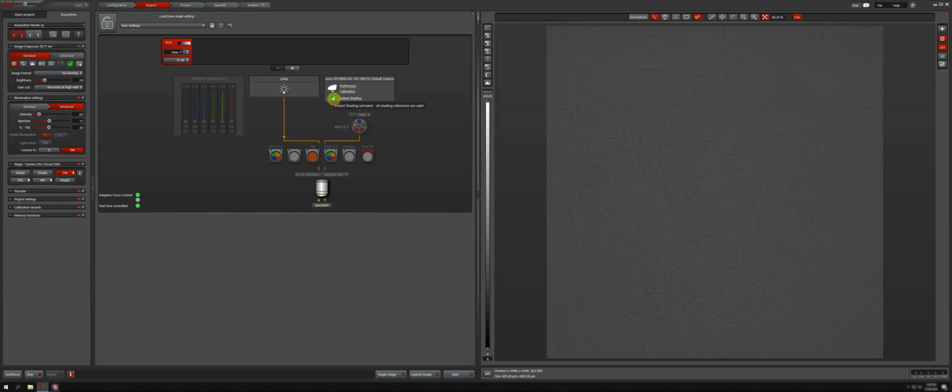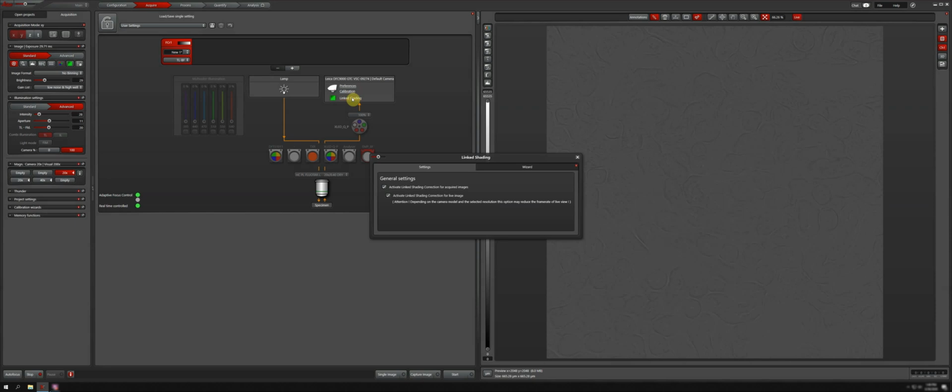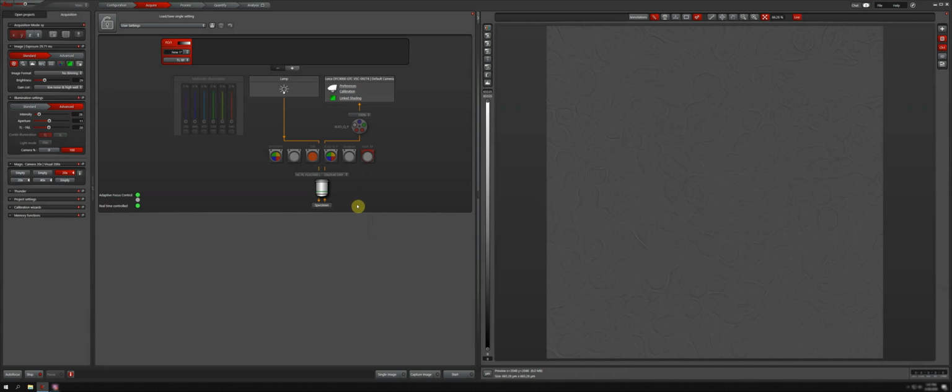You should note though that if you deactivate the shading correction and then activate it again, by default the linked shading correction for live image is ticked. That completes how to work with the wizard and acquiring reference images for shading correction, and now I will also show you another situation where the effect is bigger.